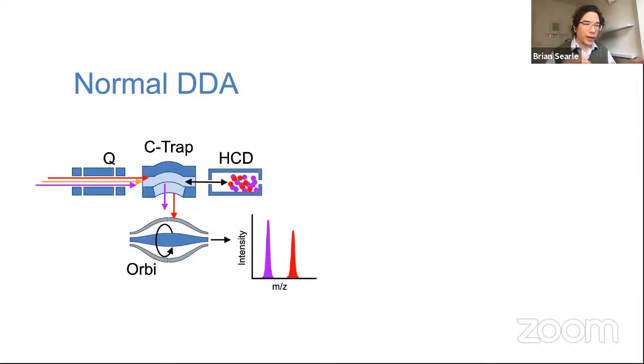So if we're trying to collect 1 million ions, and we're measuring something that is 3 or 4, or 5 or 6 orders of magnitude down, there might just not even be any measurable ions associated with the peptide that you're interested in. And all of a sudden your signal for that particular peptide disappears.